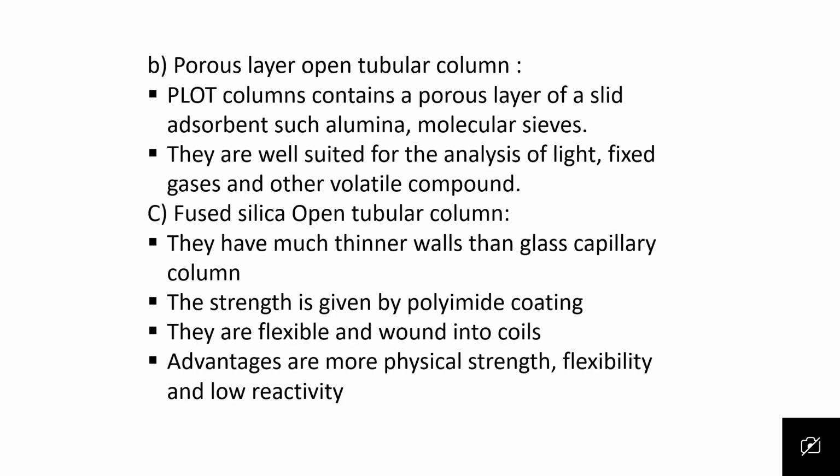Fused silica open tubular column. They have much thinner walls than glass capillary columns. The strength is given by polyimide coating. They are flexible and wound into coils. Advantages are more physical strength, flexibility, and low reactivity.